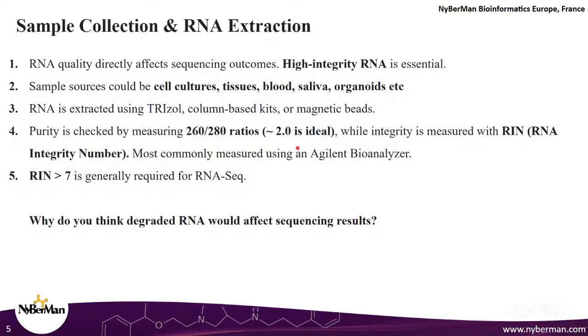Anything less than 2 would mean that you might have some protein contamination, and anything greater than 2 means that you might have some excess DNA contamination in your sample. And that makes sense, because proteins absorb UV radiation best at 280 nanometers. In a ratio where the 280 nanometer absorbance is the denominator, you want a higher value, not lower values, because that would mean that absorbance at 280 was higher, and that would automatically mean that your sample has more protein than nucleic acids, right?